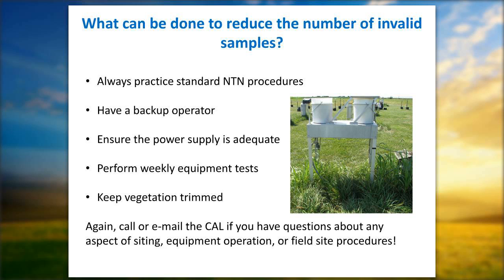I mean, we shake them out as best we can when we're packaging the materials, but it's always good practice to upend the bucket before you put it in the collector, holding the rim with the bag so you're not grabbing the rim, but dump any rinse water out of the bottle or the bucket before you attempt to decant the sample. So good catches. Appreciate those questions.